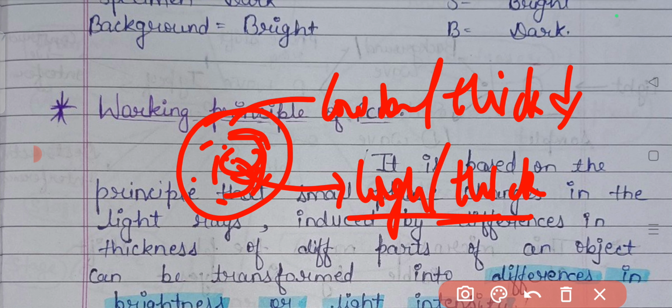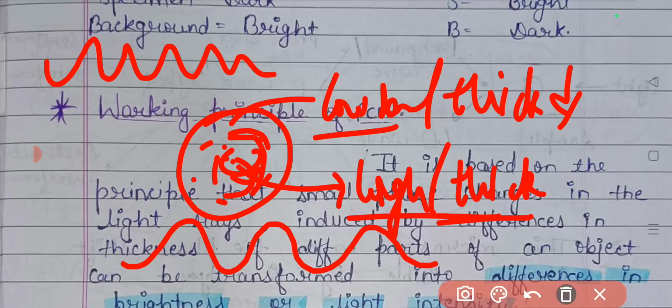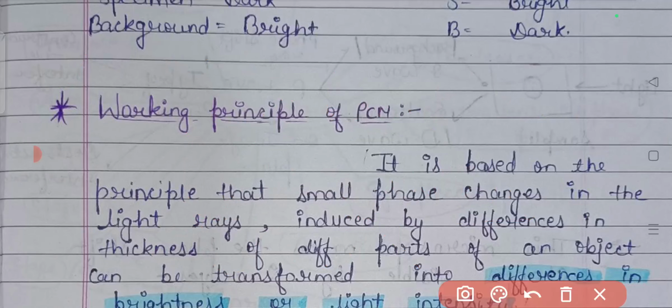So as a result, whenever the light strikes the specimen, it will form different types of waves. In case of a specimen with high thickness or high density, a condensed medium, light will get absorbed and as a result it will travel slowly, not fast. But in the part of the specimen which has low density or low thickness, a lighter medium, light is not absorbed and it will travel fast. So according to that, scattered light varies according to the composition and the density of the sample, and we will be seeing a clear and contrasted image based on the density and the composition of the sample.